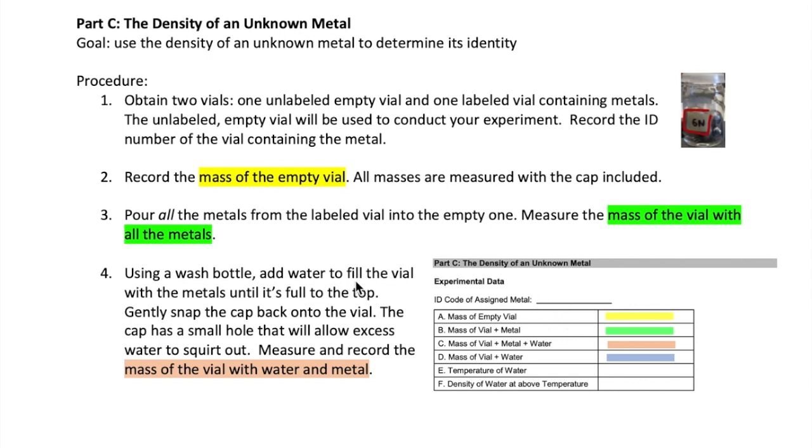Now you will go ahead and measure 4 different masses using the unlabeled vial. All the masses would be measured with the cap included. First, just measure the empty mass of the vial and record it where the yellow spot is. And then transfer all the metals from the labeled vial to the unlabeled vial. And then measure and record the mass of the vial containing the metal and record it here.